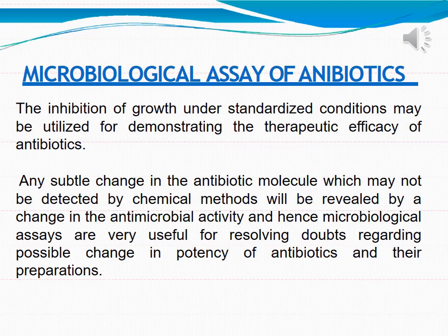antibiotic. So it says that inhibition of growth under standardized conditions may be used as a method for demonstrating the therapeutic efficacy of your antibiotics. Even a small change in the structure of the antibiotic molecule can lead to a vast difference in its antimicrobial activity, and hence microbiological assays are very useful for resolving doubts regarding possible changes in the potency of the antibiotic and their preparations.